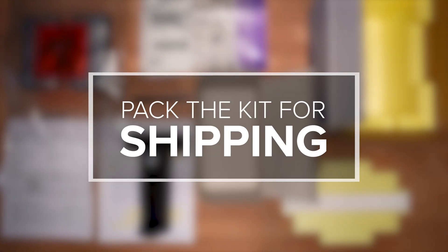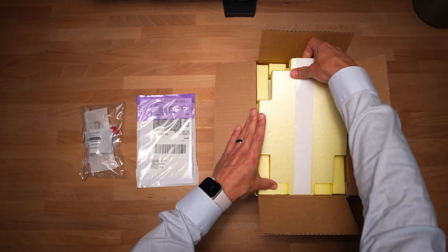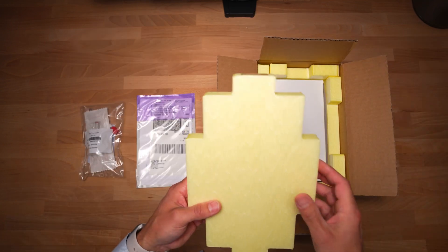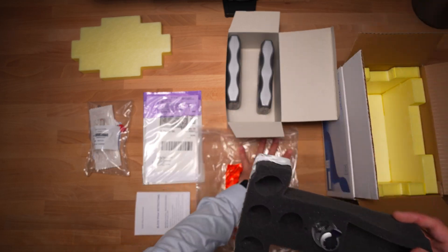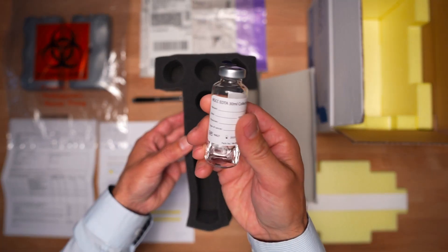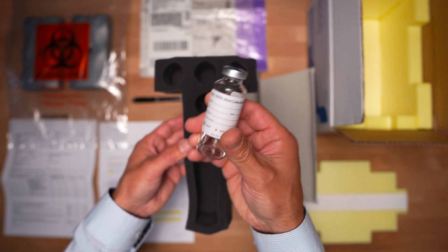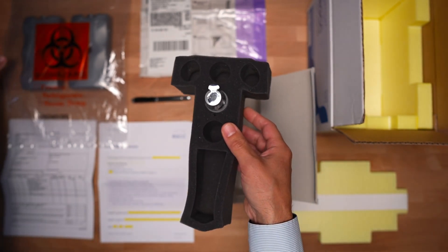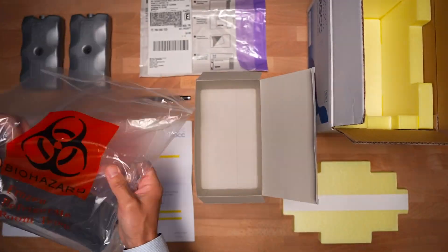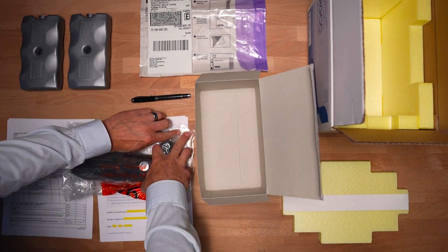How to pack the kit for shipping? A shipping instruction guide is included in the kit. Remove the top puzzle piece using the white strap. Remove the molded foam inside the biohazard bag and place vials in the round slots of the molded foam. Place additional substances to be tested in the rectangular space. Place molded foam with vials back into the biohazard bag, ensuring to release all air before sealing the bag.